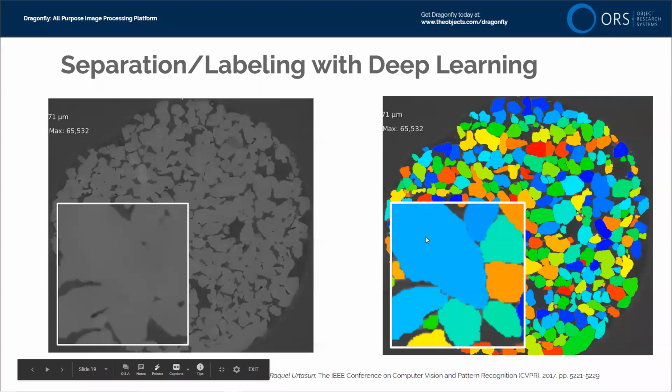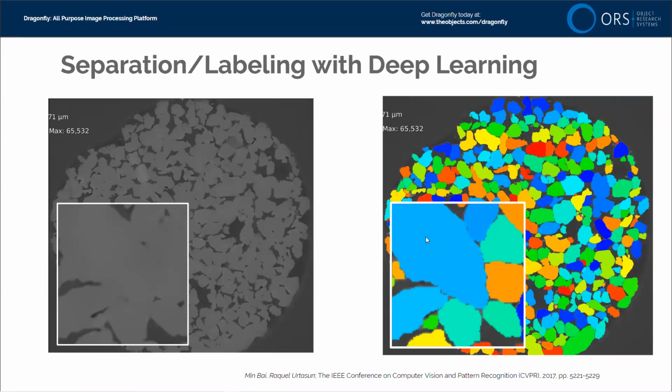Next question, is instance segmentation possible at this point if you paint cells with a smaller region? Well, that's an interesting idea. I'd like to see the results of that. It would certainly require more effort on your part on doing the training data. So you could, in individual 2D slices, paint just the interior and leave the exterior unpainted. That's very similar to the way I answered Aya's question, except I think it would be easier for you to paint the boundaries than to paint the core of the grains. I don't predict that you would get good results, but I don't always make the right predictions. So it's certainly an experiment that is not that time consuming to try.